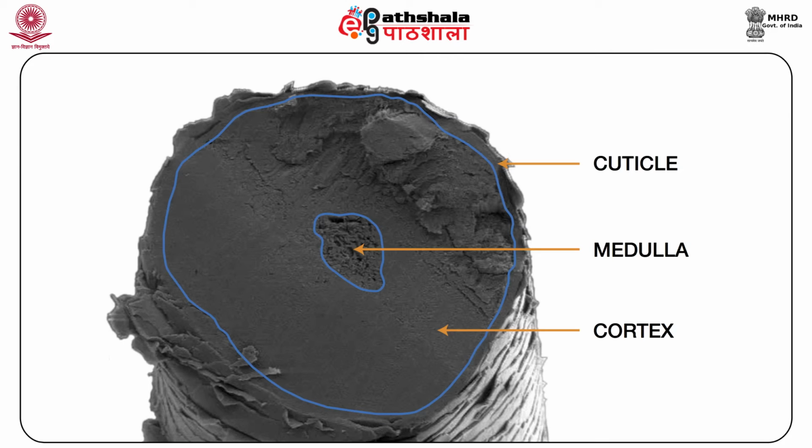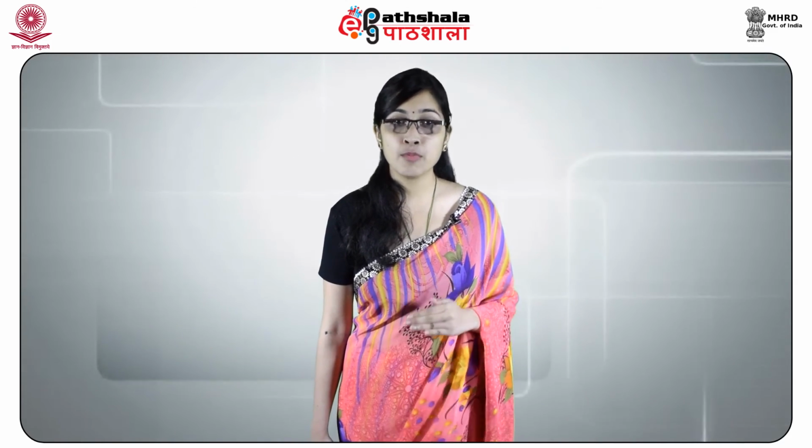The cross sections of the hairs obtained are placed on a microscopic slide treated with albumin. The embedding material is removed with a suitable solvent and the sections are fixed in Canada balsam. Microscopy reveals the cross-sectional structure of the hair. Microtomy is helpful to determine the pigment distribution, medullary shape and medullary index of the hair.